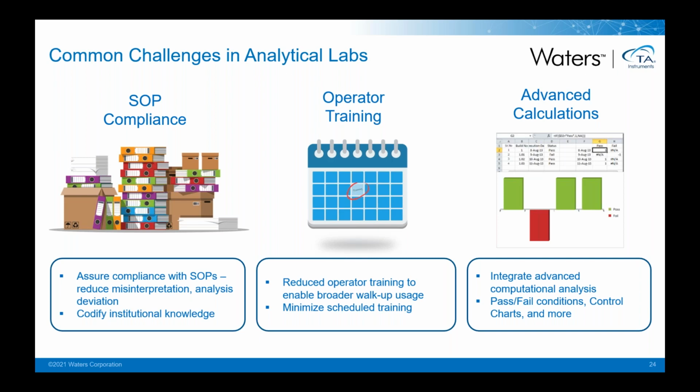Then there's operator training: as new people come on board, as more people come on board, as your production increases and the needs increase, being able to reduce the amount of time it takes to teach and train operators on every little instance of sample prep, method development, analysis, and reporting.